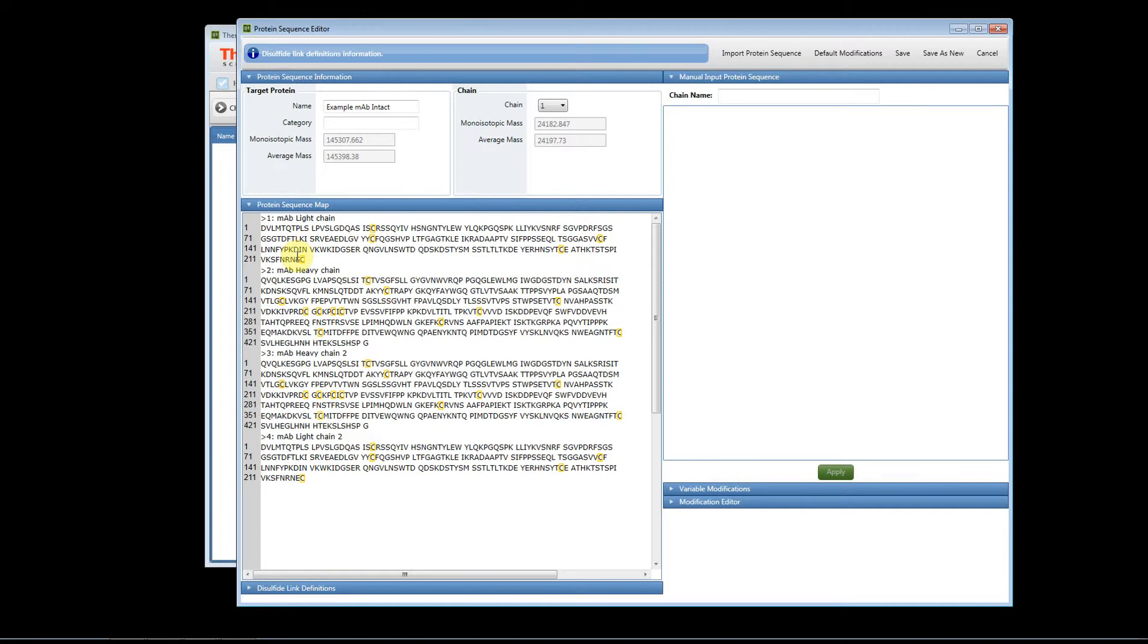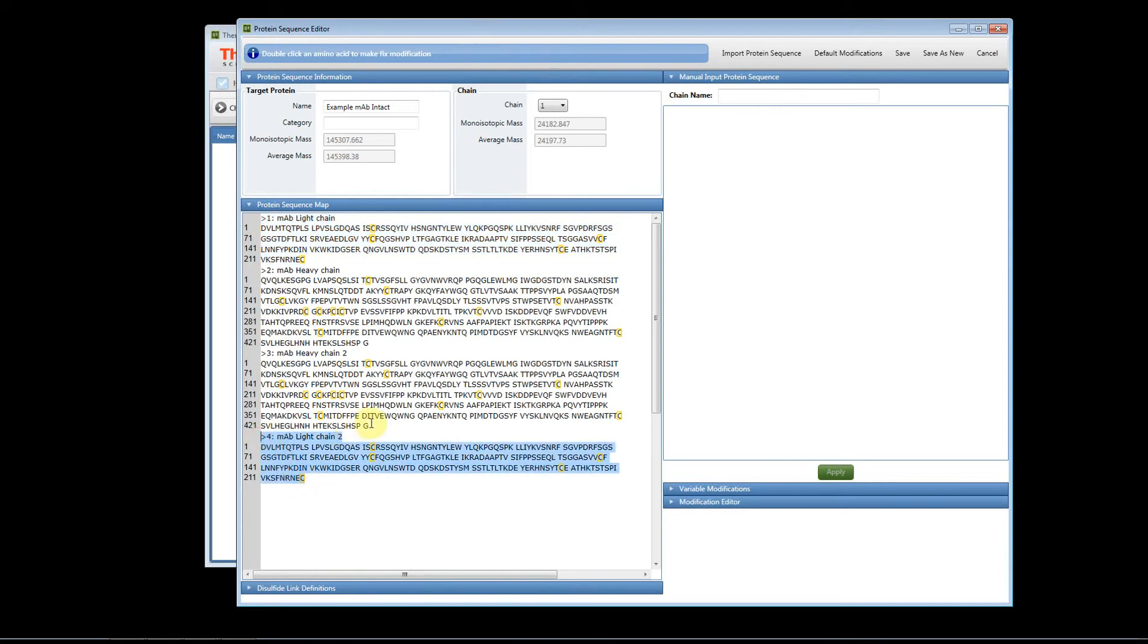Now this FASTA file, let me expand this so you can see, because we're looking at an intact antibody which means we have two light chains and two heavy chains, we need to add two copies of each one of those, of the light chain and the heavy chain, to the FASTA file. In this example you'll see that we have light chain one and here we have light chain two.